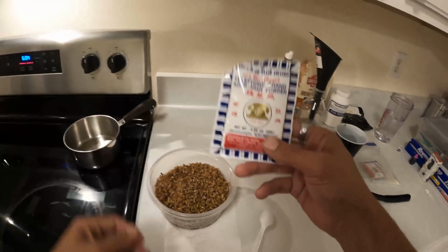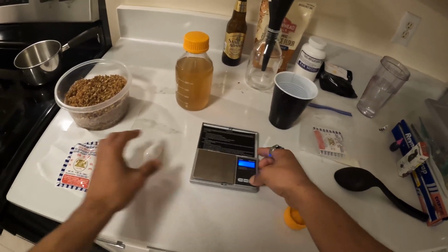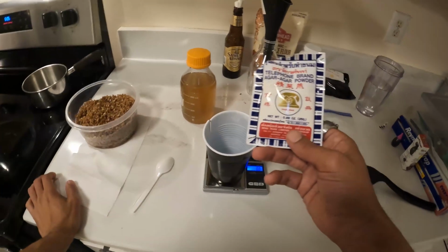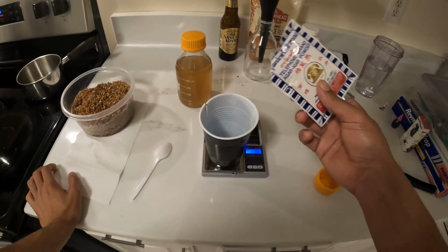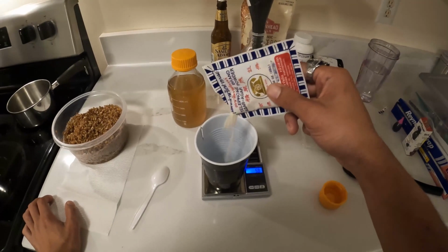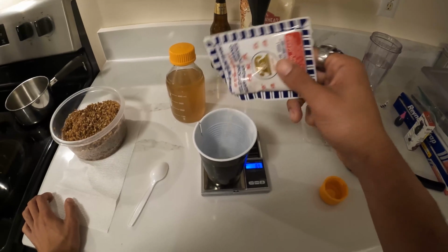agar. Now, the recipe that I like to use for these is roughly 8 to 10 grams of agar per 500 milliliters. So I don't really like a really hard agar. I like it to kind of be soft. If it's too hard, then sometimes the spores or the tissue sample just has a difficult time taking off.